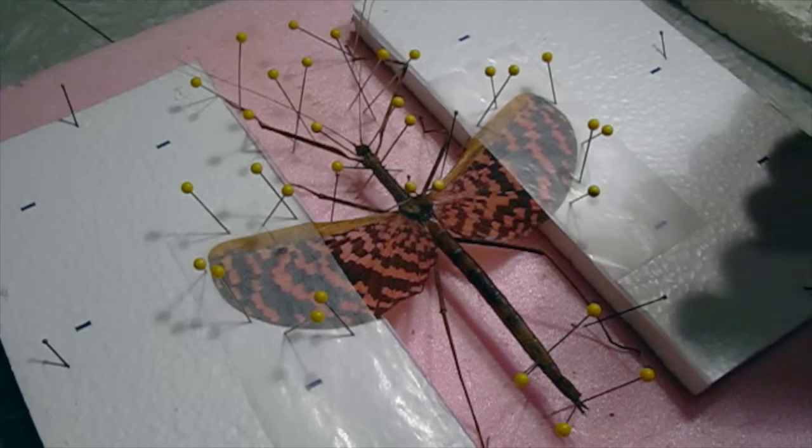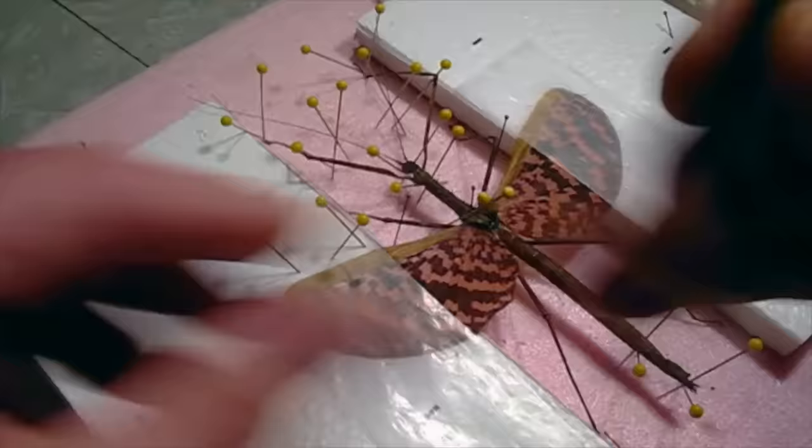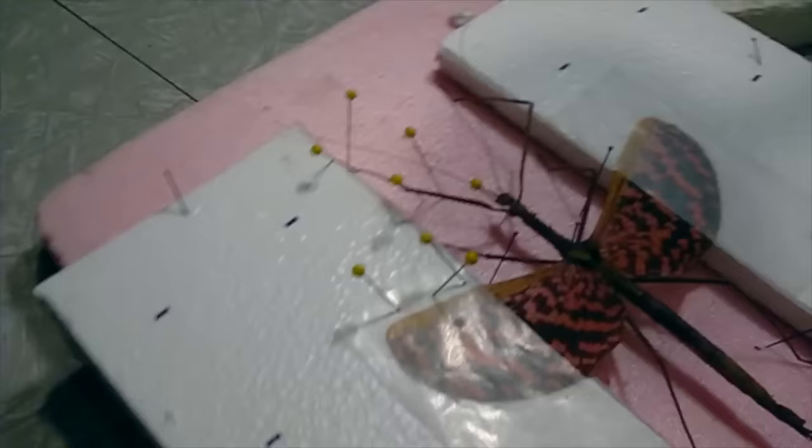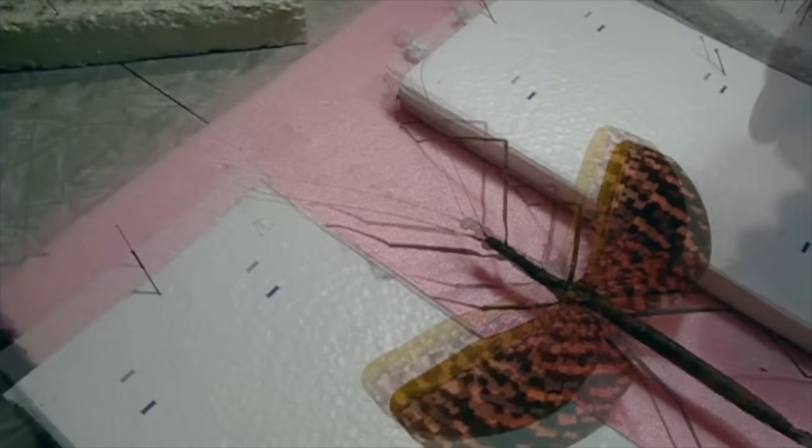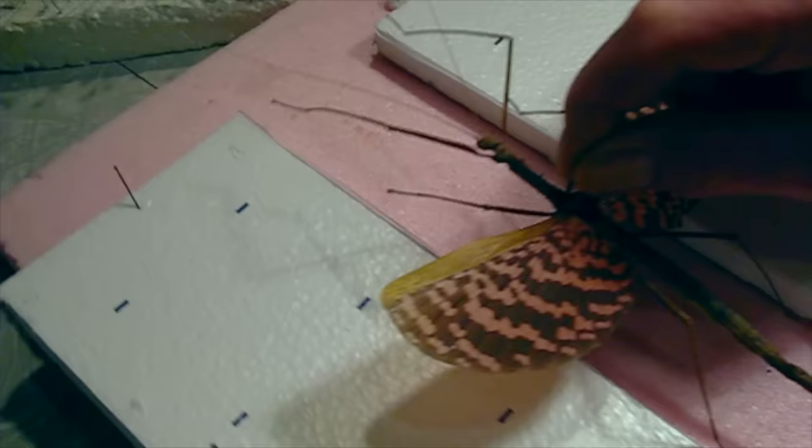Now we're going to pull the pins and lift the specimen up. It's really good — very nice.